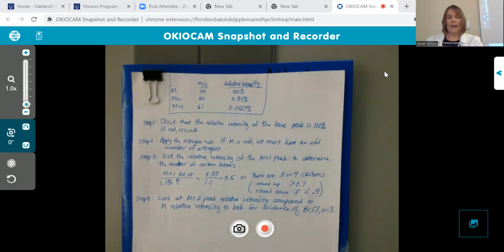If I had bromine, what would be the relative intensity relationship between M and M+2?